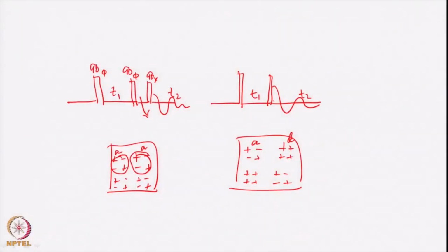But notice also we demonstrated a new concept in that process, and that is called the selection of coherence transfer pathways. In other words, different components of the coherences were selected in the two cases. For example, if I were to take a point like this here at this point or at this point, the density operator we had created had these sort of terms: IkZ, then IkX ILY, and IkY and IkZ ILY.